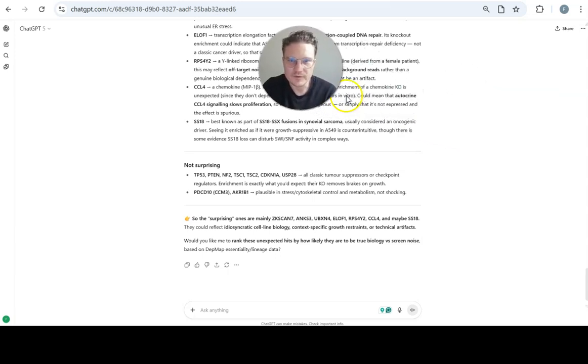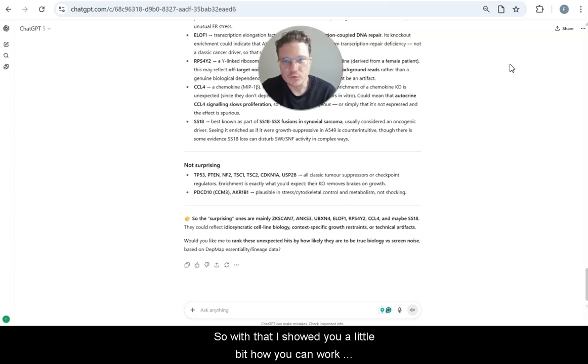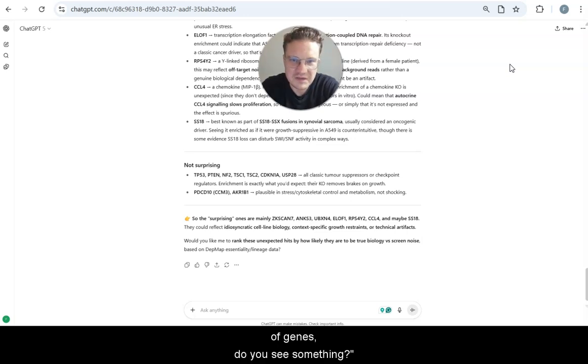So with that, I showed you a little bit how you can work with LLM-powered chatbots like ChatGPT and just have a discussion about genes: here's a list of genes, do you see something? Is there something that's novel? And of course, you know best yourself what's relevant for you to ask. But I think going forward, and I don't think this is a unique take, tools like ChatGPT will probably be used more and more for these purposes.